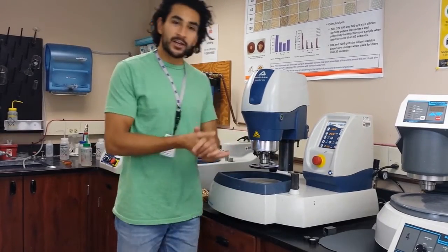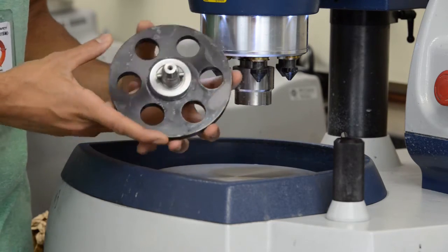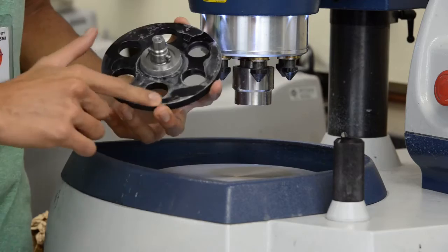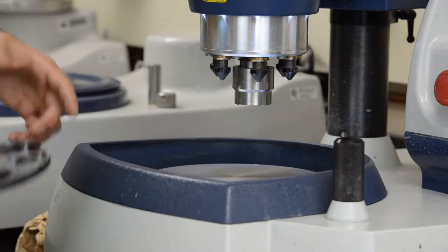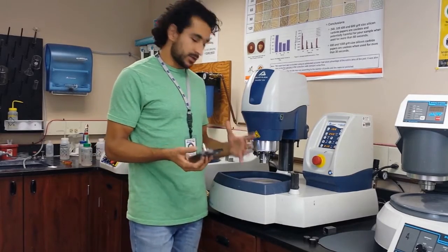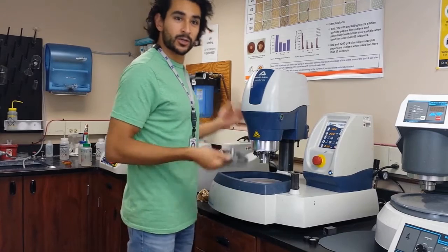The first thing I noticed was that whoever used this last time did not clean it. See all these stains? This person did not clean the equipment. You need to clean your equipment — it's really aggravating when you come in and it's just dirty. So I'm going to go clean it.